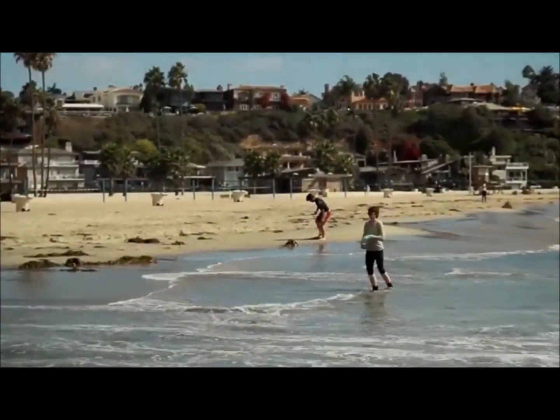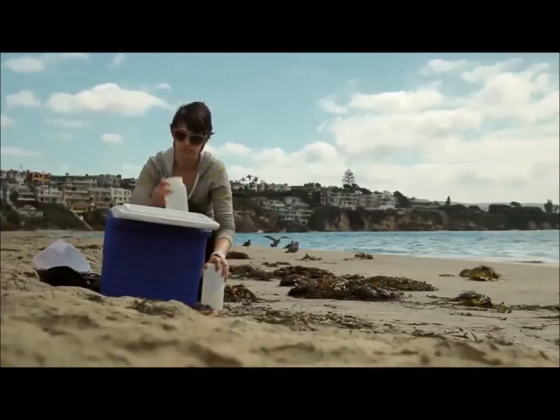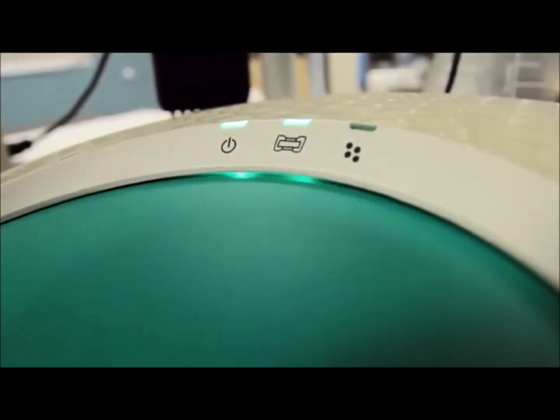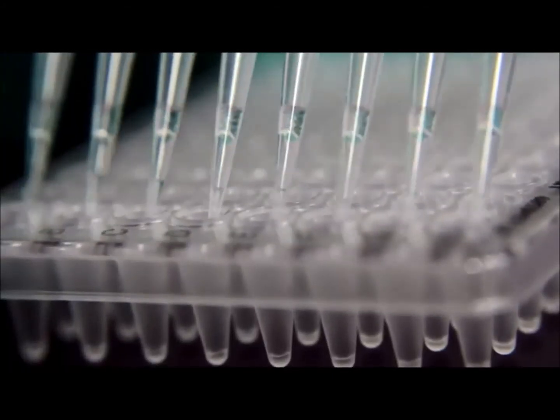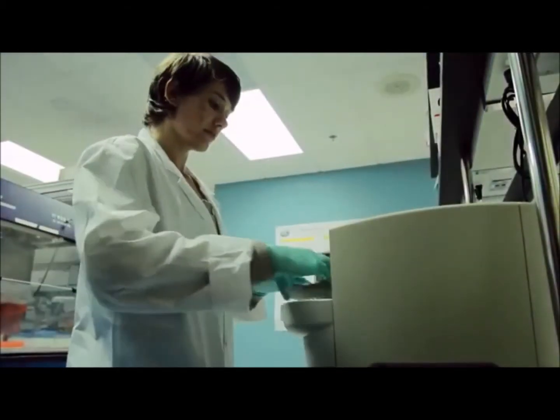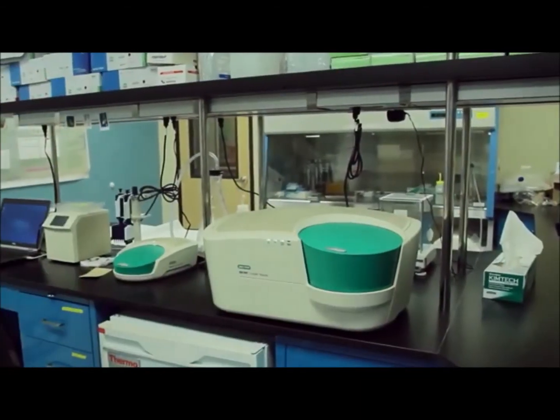So our goal is to bring the best methodology for testing water to the entire country. Well, what we'd like to see is all the monitoring agencies replacing qPCR with the droplet digital PCR. And the reason for that is we feel it's going to be more accurate and better protect public health. So with the droplet digital PCR, it's really exciting. It's a technology for the future, and it really opens the doors to a lot of research questions we were not able to answer before. So a lot of new projects are getting started because of this technology. So it's fun, it's very exciting.